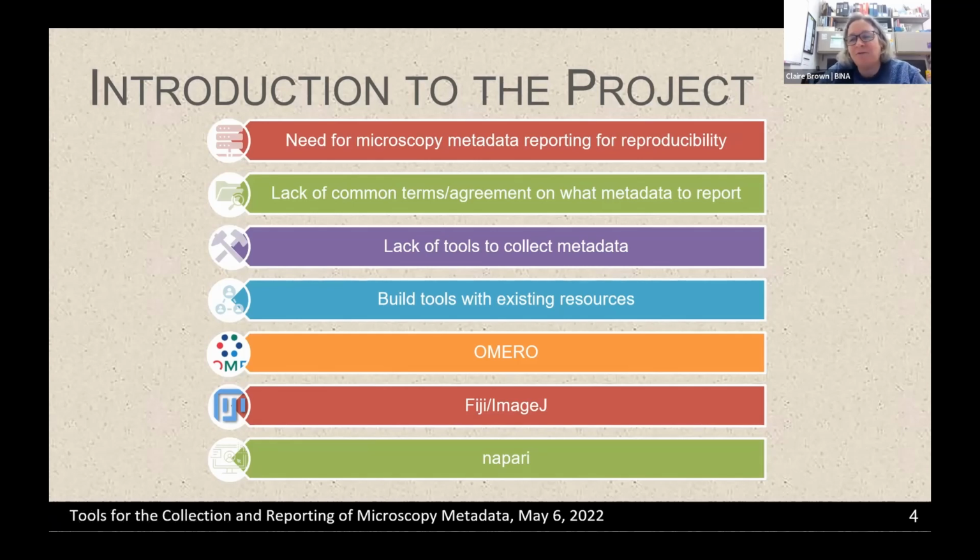So if you do have time to go back, Caterina gave a really nice 10-minute overview of a lot of information and really outlined well the need for microscopy metadata. I think the fact that you're all at this workshop, we probably don't have to convince you too much of that, but in order to do that, we really have to come to common terms and agreement on what metadata to report. And that's been really great, having these different organizations that are really representing the community.